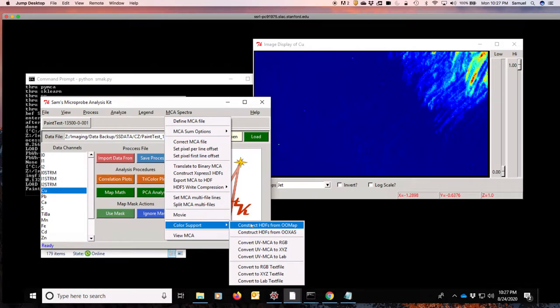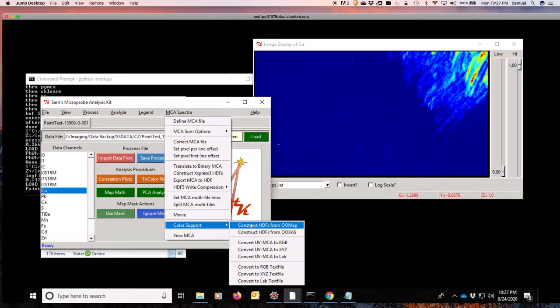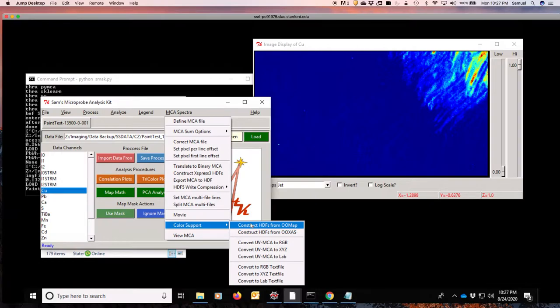Now just like we can do this for a mapping dataset, we can also do this for XAS. The beamlines at SSRL are also set up to be able to collect a spectrum at every single pixel, every single point, energy point in an XAS spectrum. And so the same program here can parse either the XAS data or the map data. Since we're working with maps here, we'll worry about this first.